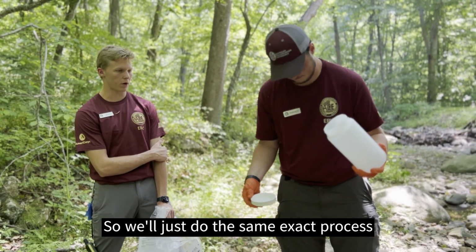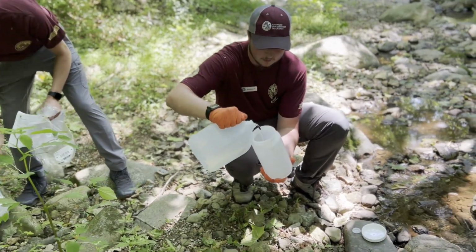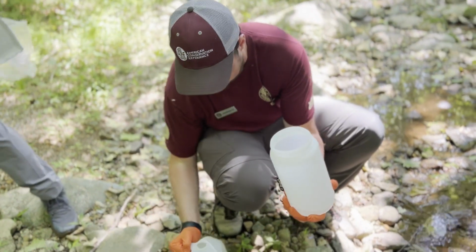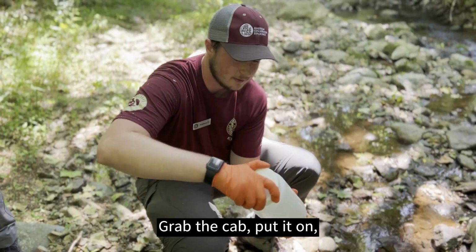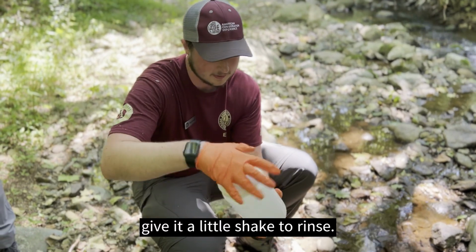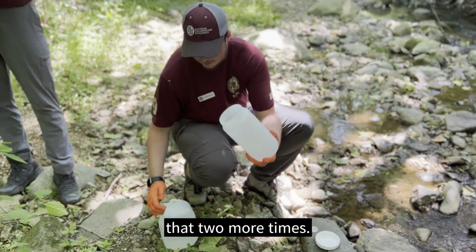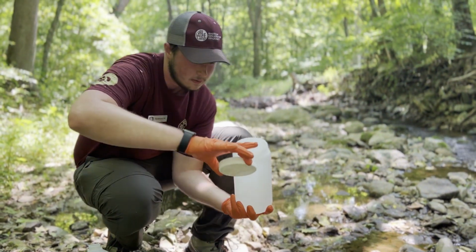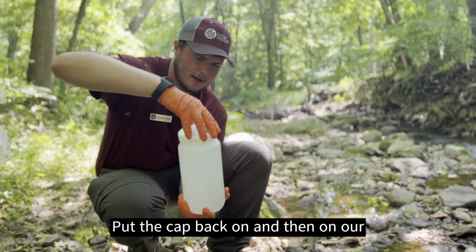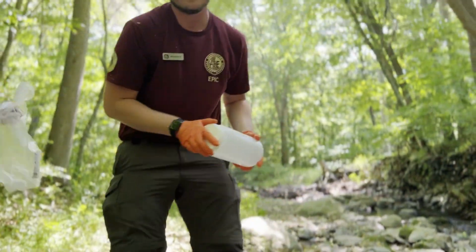So he'll do the same exact process. I'm just going to take a little splash, put it in, grab the cap, put it on, give it a little shake to rinse. Dump it. And I'm going to do that two more times. Put the cap back on, and then on our data sheet we're going to take a note that we did a blank at this site. That's about it.